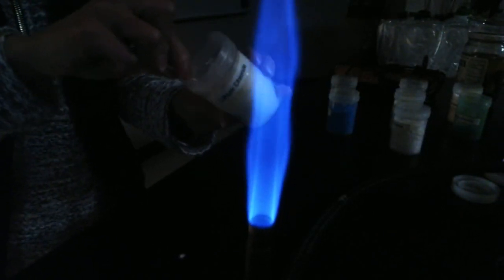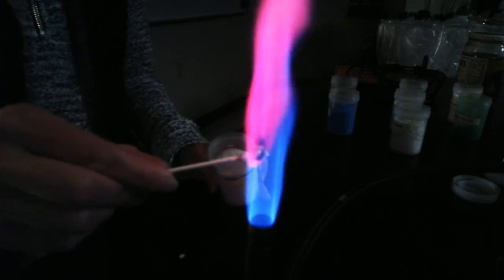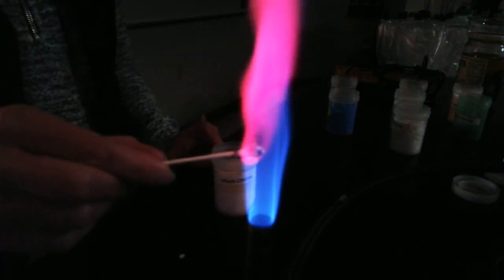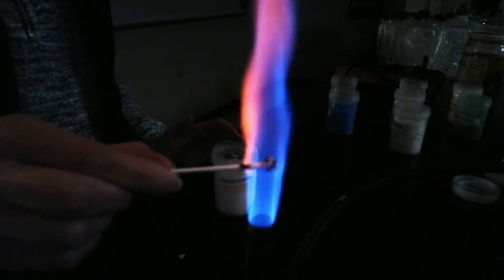And you can't really use the prism very well with this demonstration to try to separate into all the specific bands of light that are being emitted, just because there's other forms of energy emitted too. There's other light waves from the heat of the burner and the burning of the methane gas. But overall, I'm seeing this reddish pink flame.